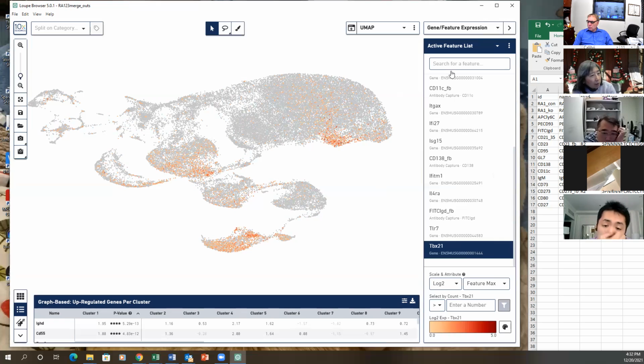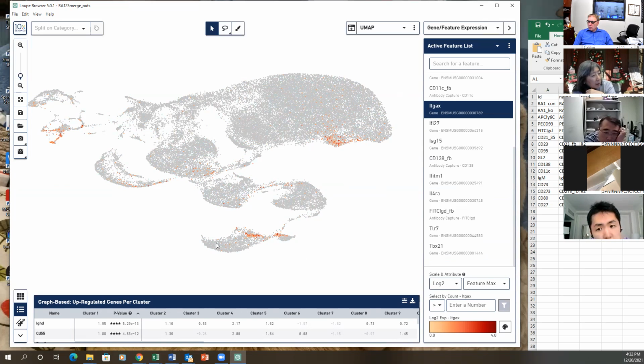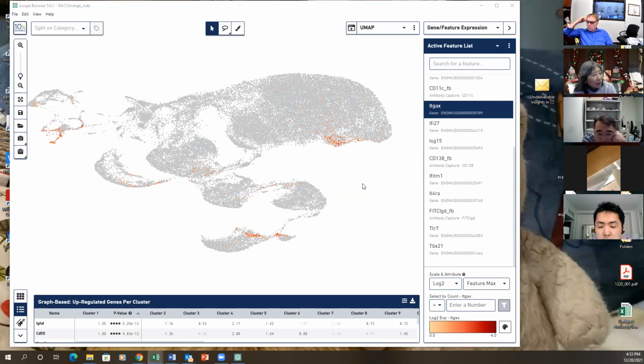What's the bottom? I don't know. I think we need to, this one, I still don't know what it is. These I don't know what they are. Anyway, somebody can spend the whole holiday working on this, right? Yeah, I already spent a huge amount of time. Anyway, Sharon did a wonderful job.